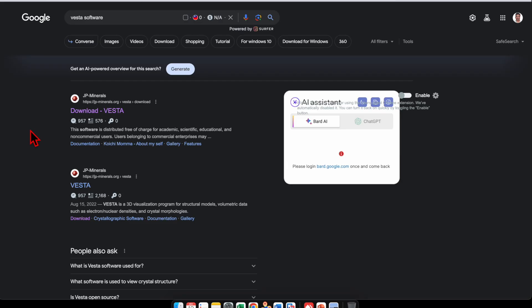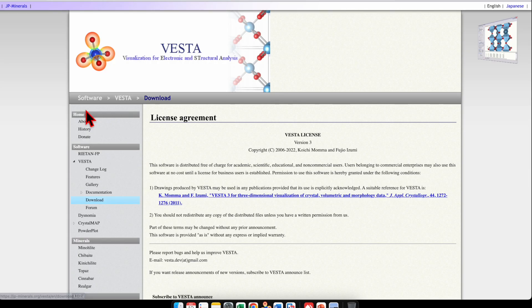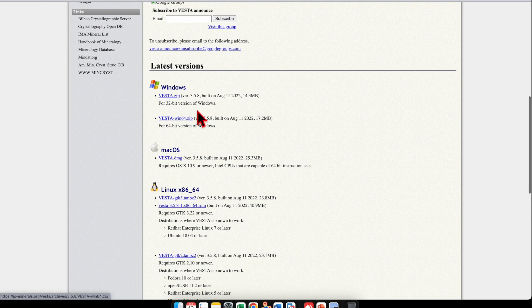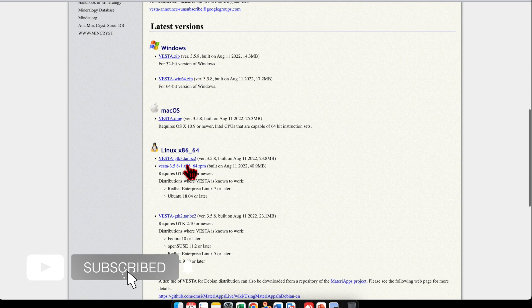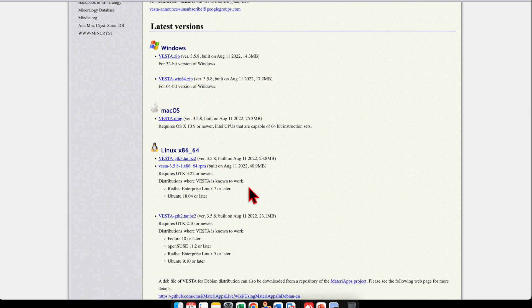Next, if you don't have VESTA software, go ahead and type 'VESTA software' in Google and click on the link. It is a free software — you can download it for Windows, Mac, or Linux.